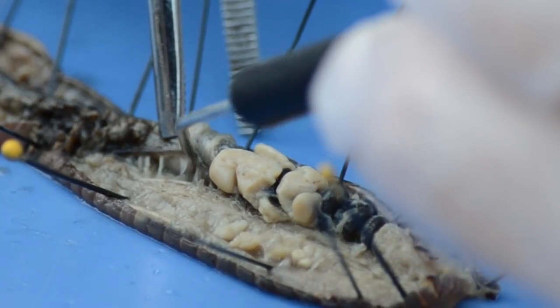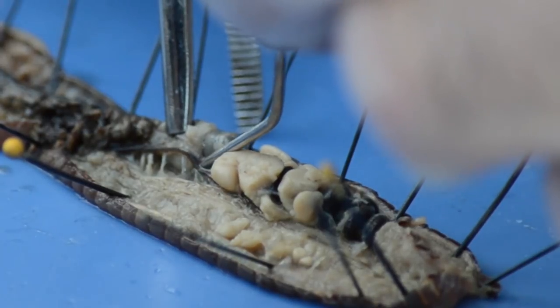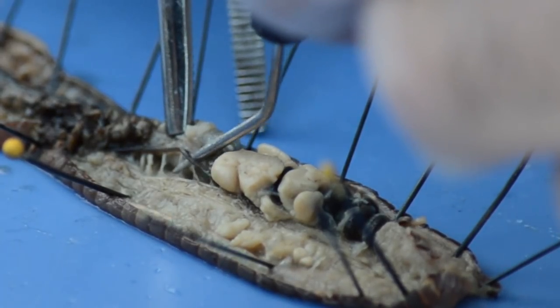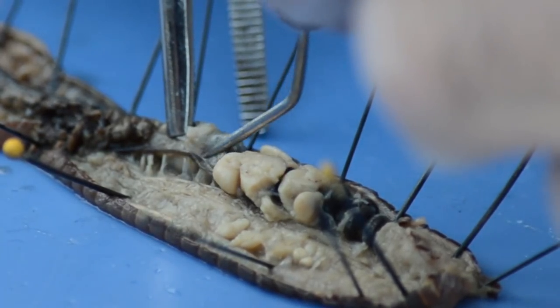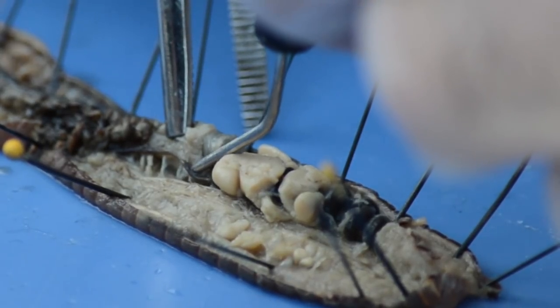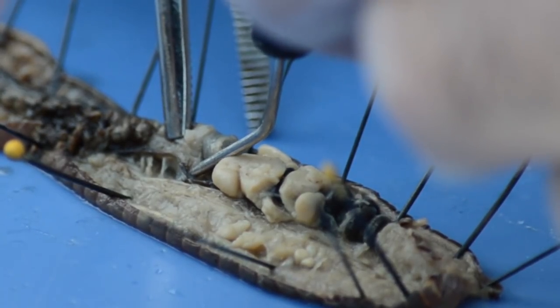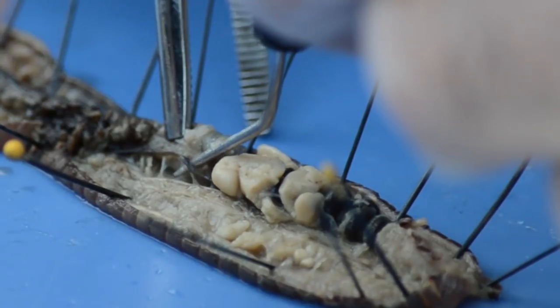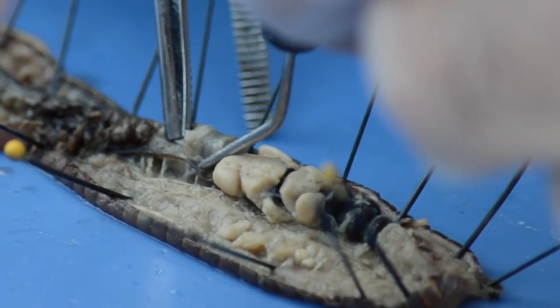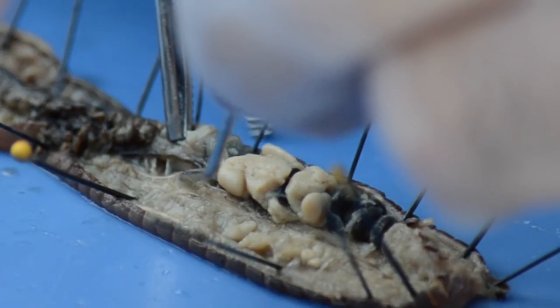Right next to that, can you see where you have a little darker vessel? I'll put my probe right underneath it. That is the ventral blood vessel coming from the aortic arches. So we have two major blood vessels we can see very easily: the ventral blood vessel and the dorsal blood vessel. And here's our ventral nerve cord.